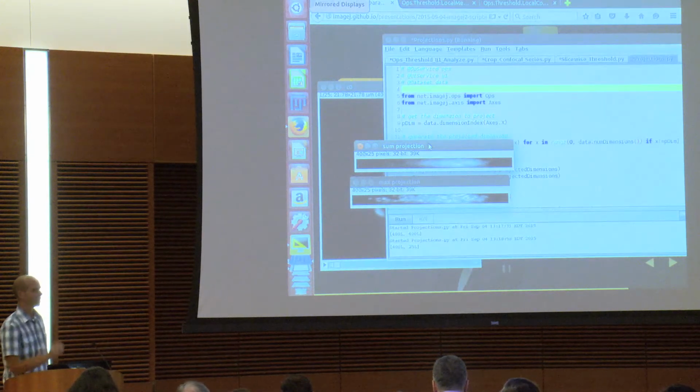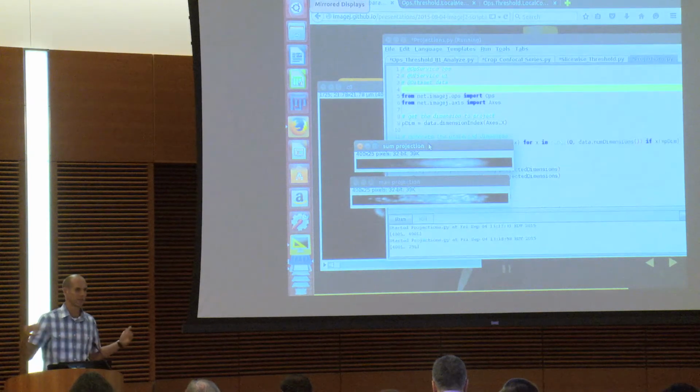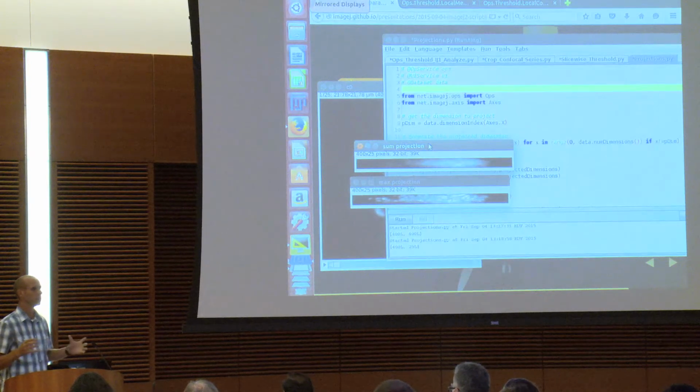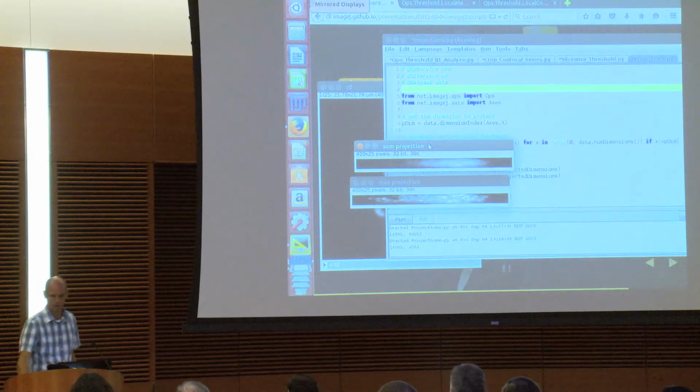So learning how to think in this way, like passing ops to other ops, is going to be really valuable, because somebody might come up with a new way to project data or a new statistic that you'd like to use for your projection. There might be simple ways to access the max projection and the sum projection, but for this new type, when it's bleeding edge, you're going to have to go back to the mixing and matching style. So as an ops programmer, it's useful to know how to do these types of workflows.